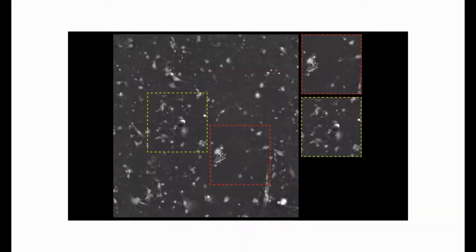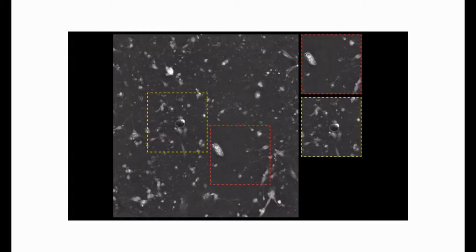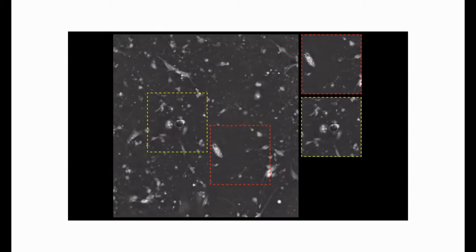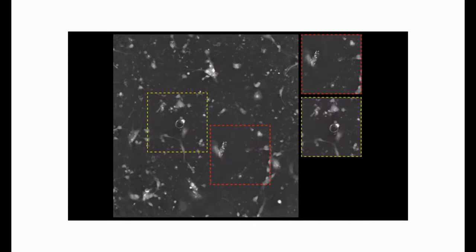Now, if we look at the yellow boxes, the cell just below the center is about to divide into two. We now have two identical cells. The cell on the left gets the munchies. It's the hungry sister, and it will shoot off, starting to eat every bit of apoptotic material it can see. Sister on the right, just below the air bubble, is doing nothing. Sister on the left shoots off to the left again and goes through and eats even more debris just off screen. Comes back, and there's a lot more to the north, so it shoots off to the north, eating even more.